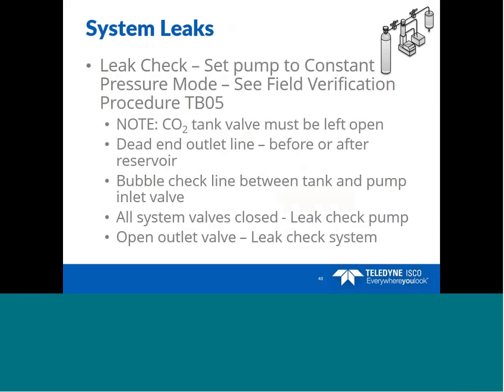Leak checks should be performed routinely, but especially with the initial setup. The leak check is performed by setting the pump to constant pressure mode, then noting the changes in the volume remaining over time to determine the leakage rate. Also, we have a field verification procedure that gives more details on this procedure.